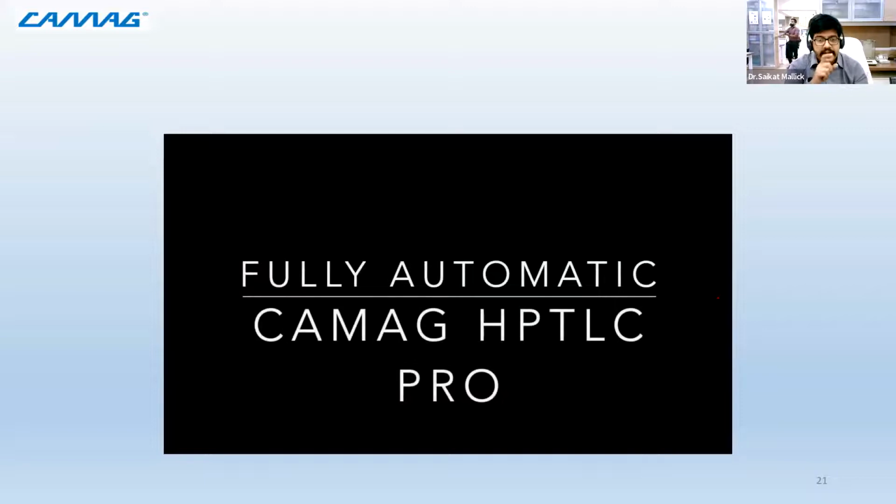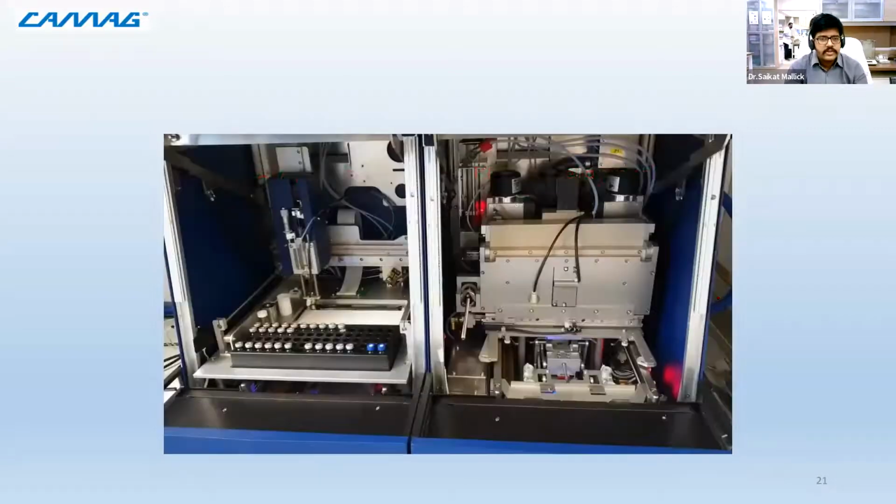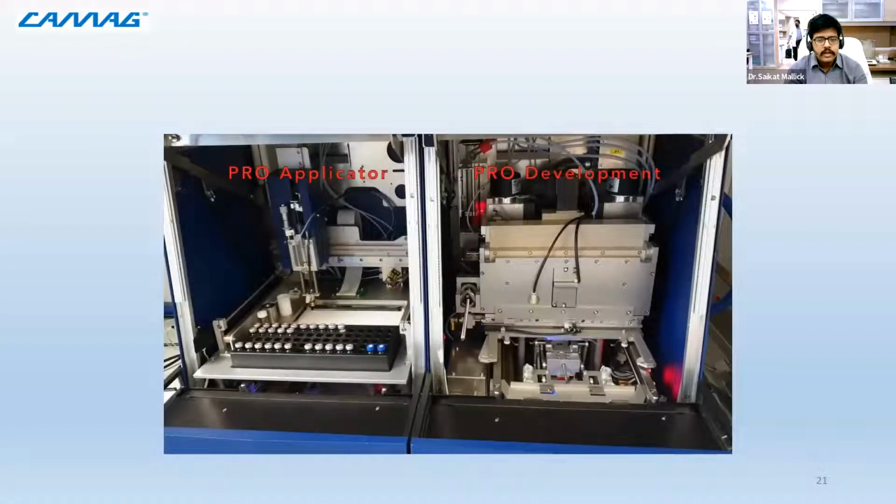So you will be hearing our director's voice, who has shot this at our facility, and there are other modules also which are coming in. Due to COVID a slight delay is there, but more or less an entirely automated aspect is there, robotic HPTLC. We'll probably change to it after, not now.